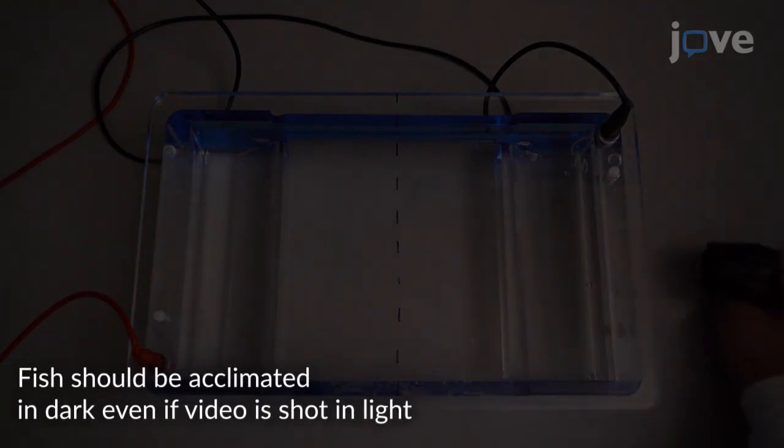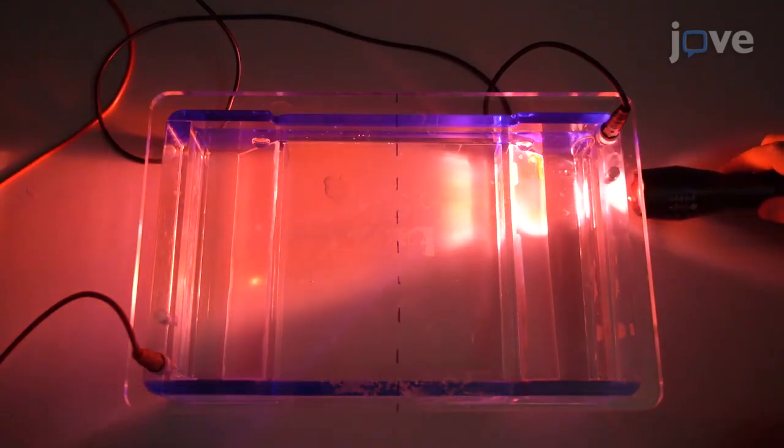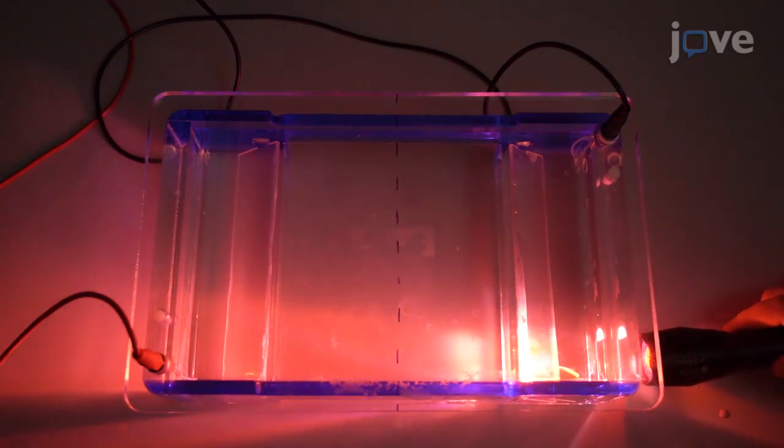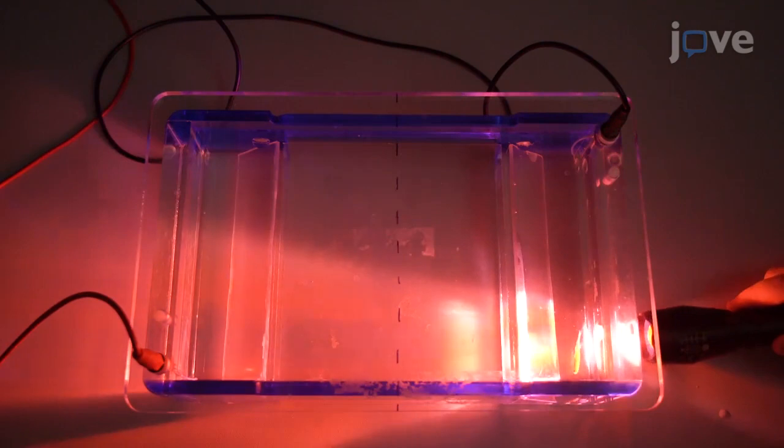After successful acclimation of the fish, manually shine an 800 lumen red lens flashlight approximately 2 cm from the gel box wall on the side occupied by the fish.